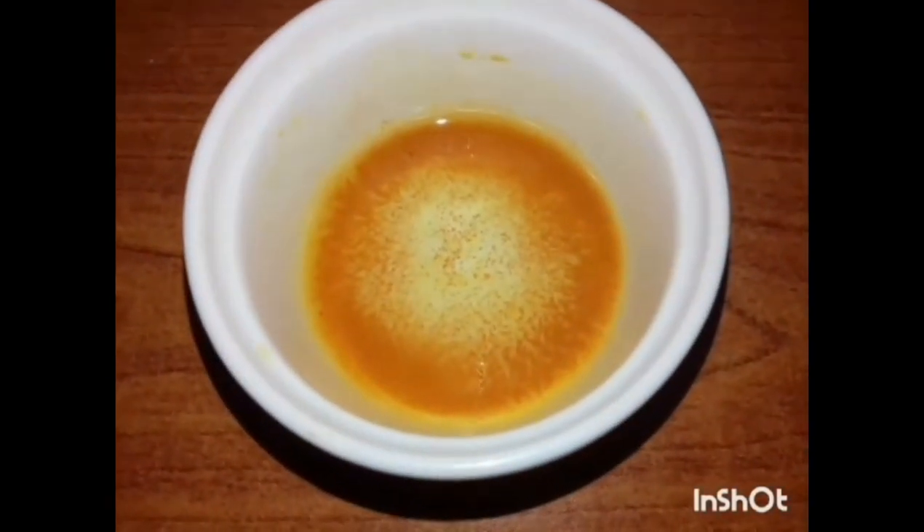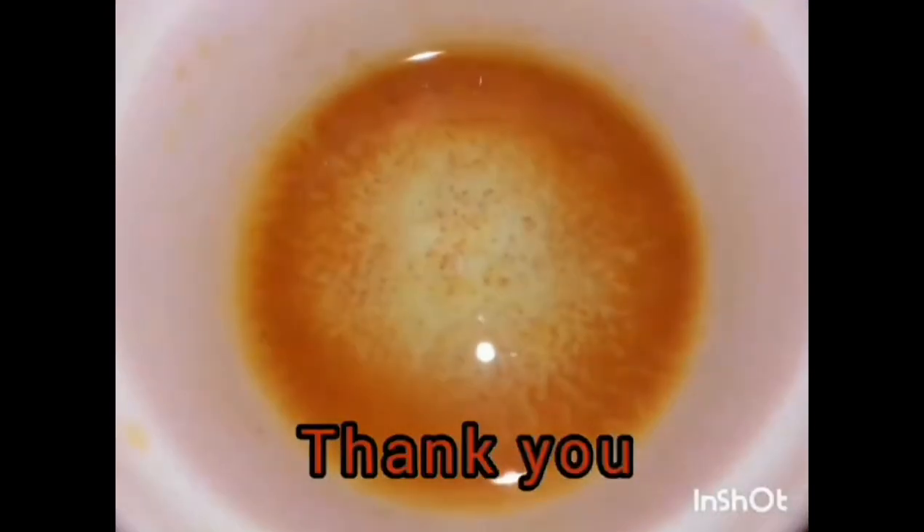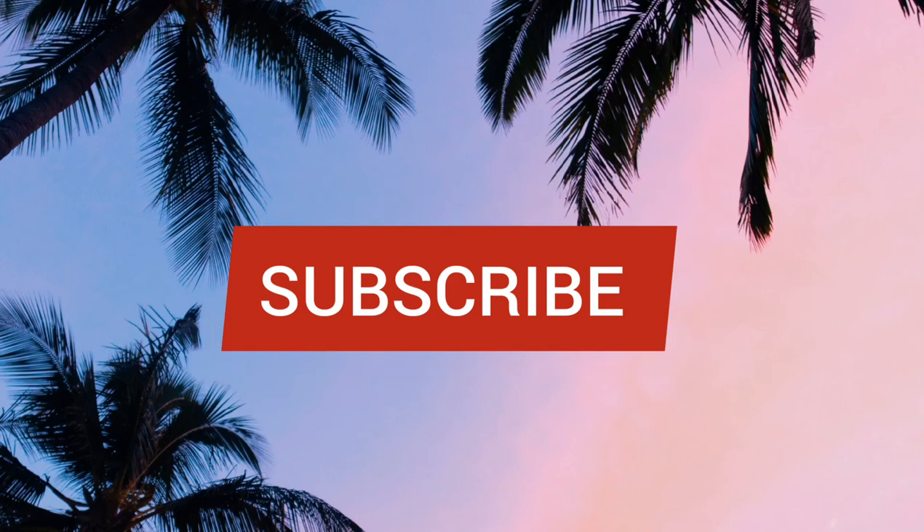Now we can observe a brick red colour after a range of colours.